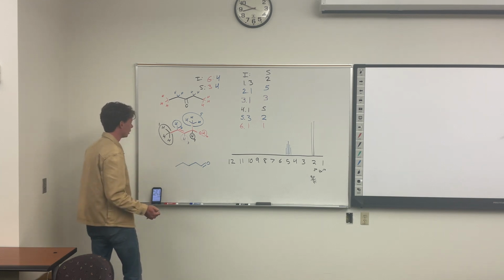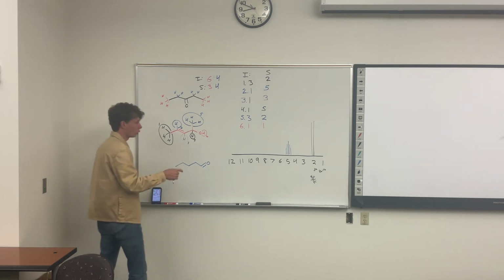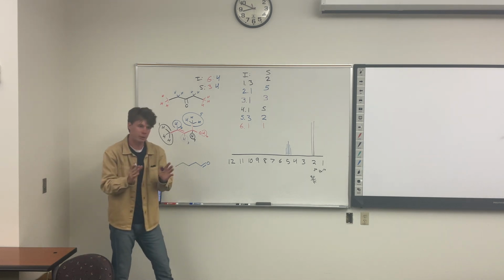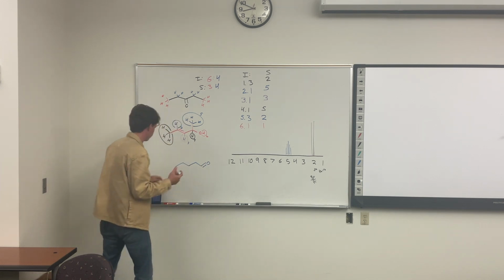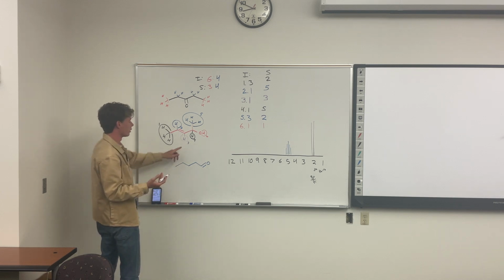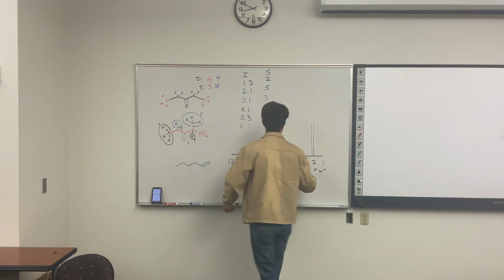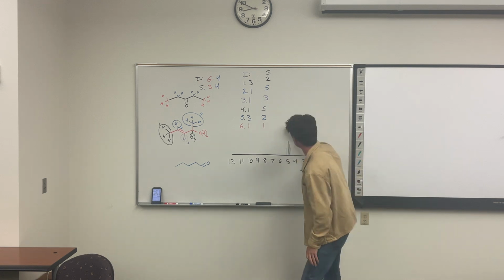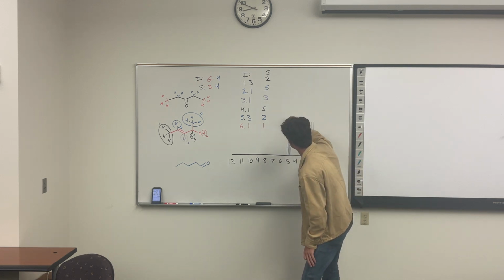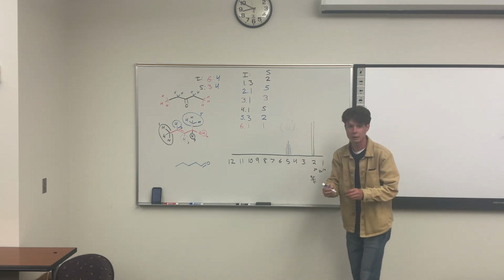But considering it's closer to the alcohol and it has more alkyl groups on it or near it, it's probably going to shift one way or the other. But we don't really know which way, at least I'm not sure. Anyway, we have another vinylic, so we're going to stick at this position. Same intensity, only split into 3. I'm just going to write it above it. That's not what happens in real life, but I'll put some parentheses here, and in the same spot we should expect something like that. I'll put it in parentheses. Tough to really see, I understand.